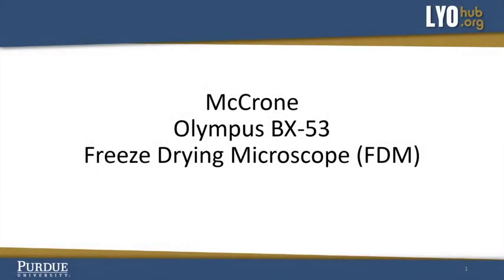The Olympus BX53 Freeze-Drying Microscope by the McCrone Group. Machine Preparation.